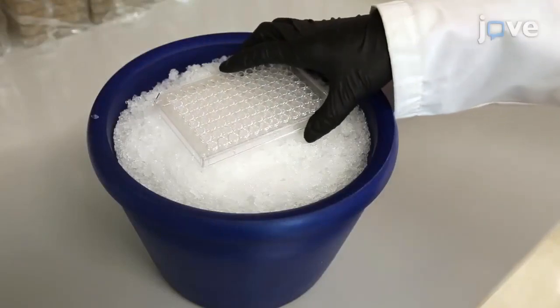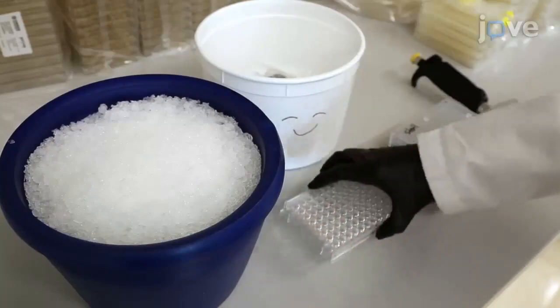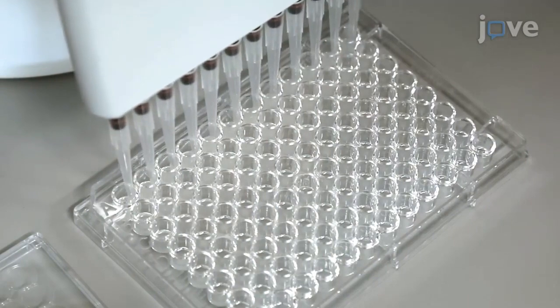Thaw the yeast glycerol stock plates with the TF prey array on ice. Resuspend the yeast using a 12-channel pipette and proceed to the next step within 1 to 3 minutes.